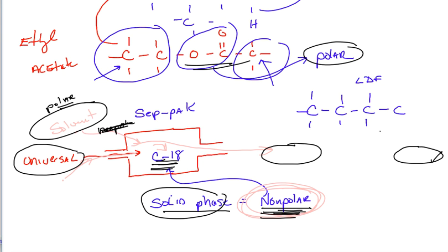Both of these tests, or in this case chromatography, should give you the same results if you understand them. And now you can see if your hypothesis of which chemical was the most polar or nonpolar works out.